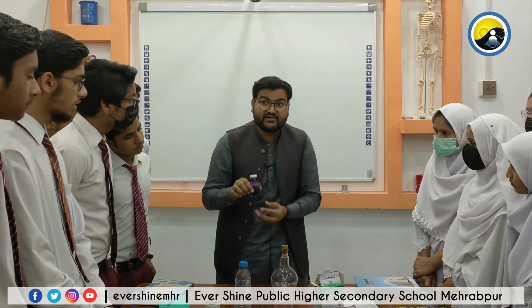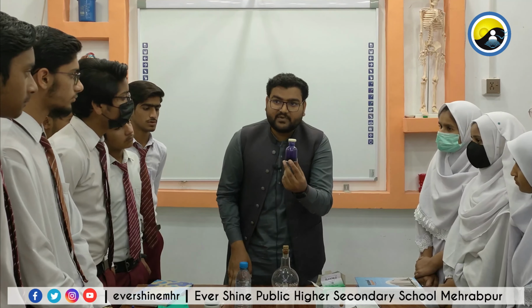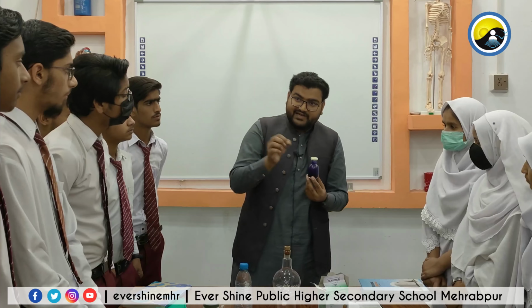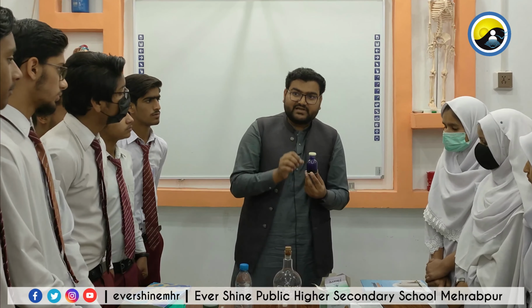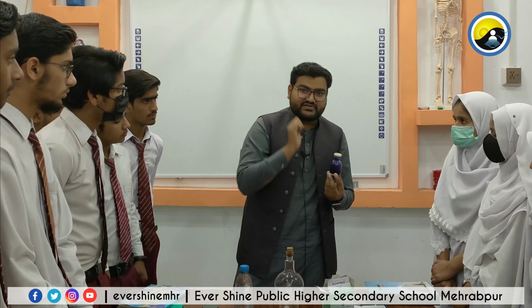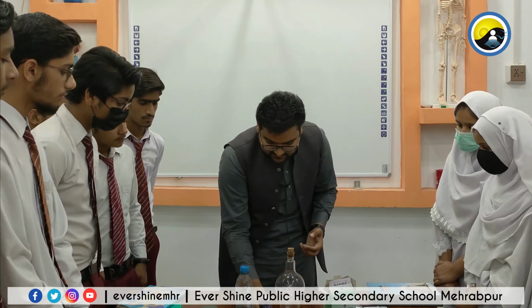And we have the indicator, methylene blue. Methylene blue is an indicator that tells us whether the reaction is shifting to the oxidation state or the reduction state. Okay, let's perform this experiment.